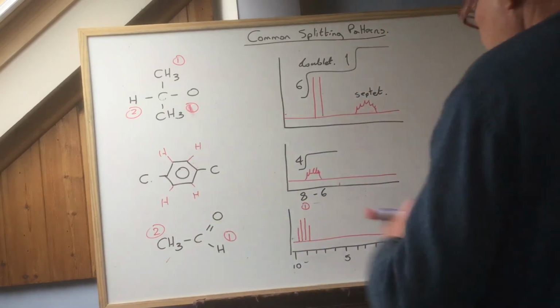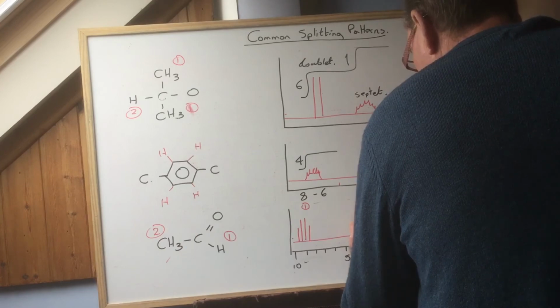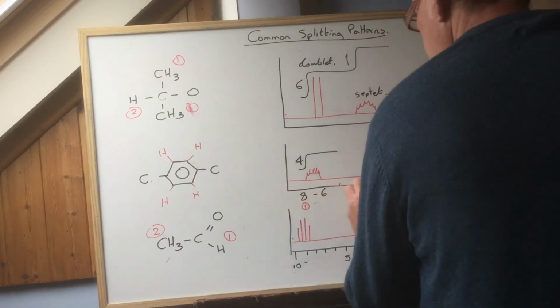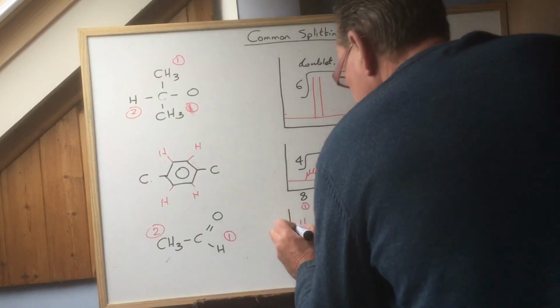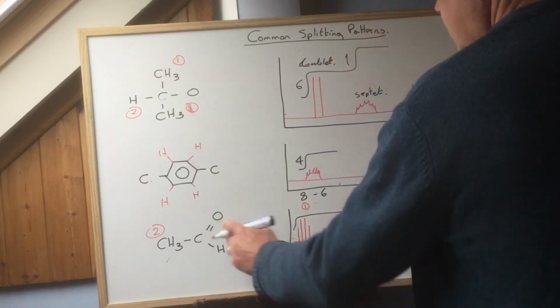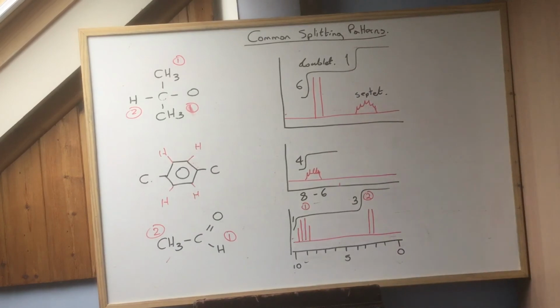So in the region 2 to 3, there. You put an integration peak on it. One proton in that environment, 3 protons in that environment.